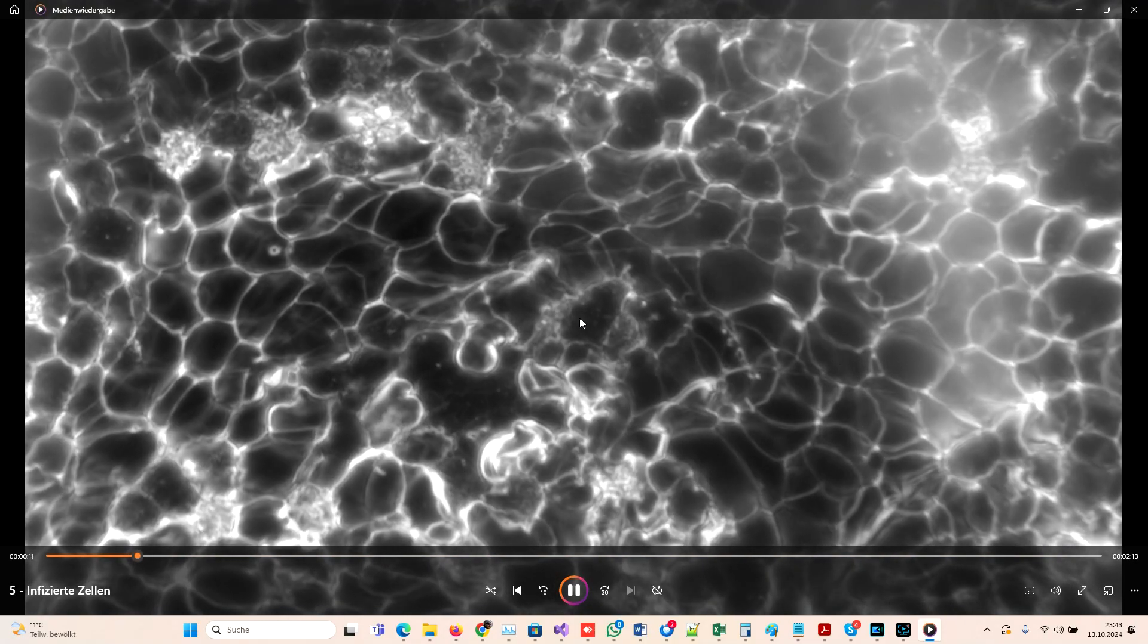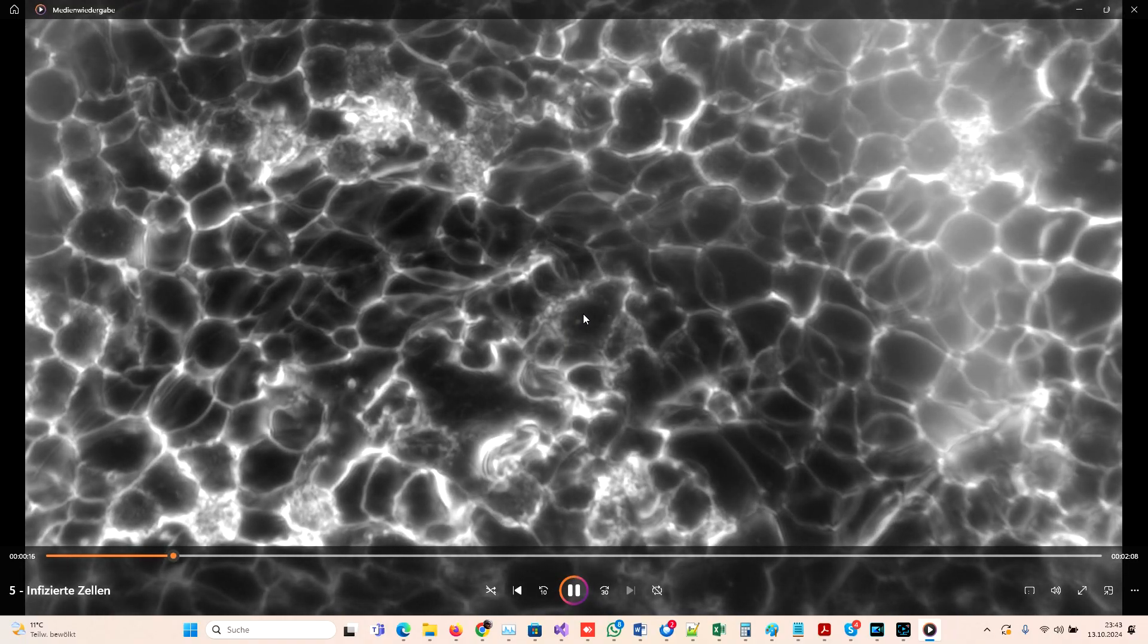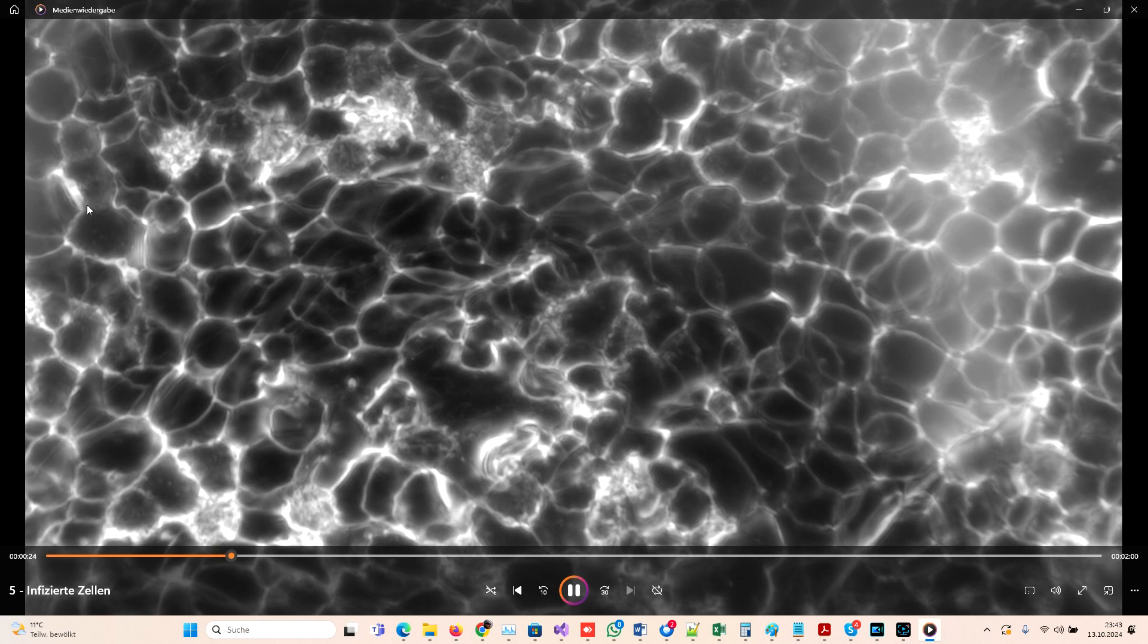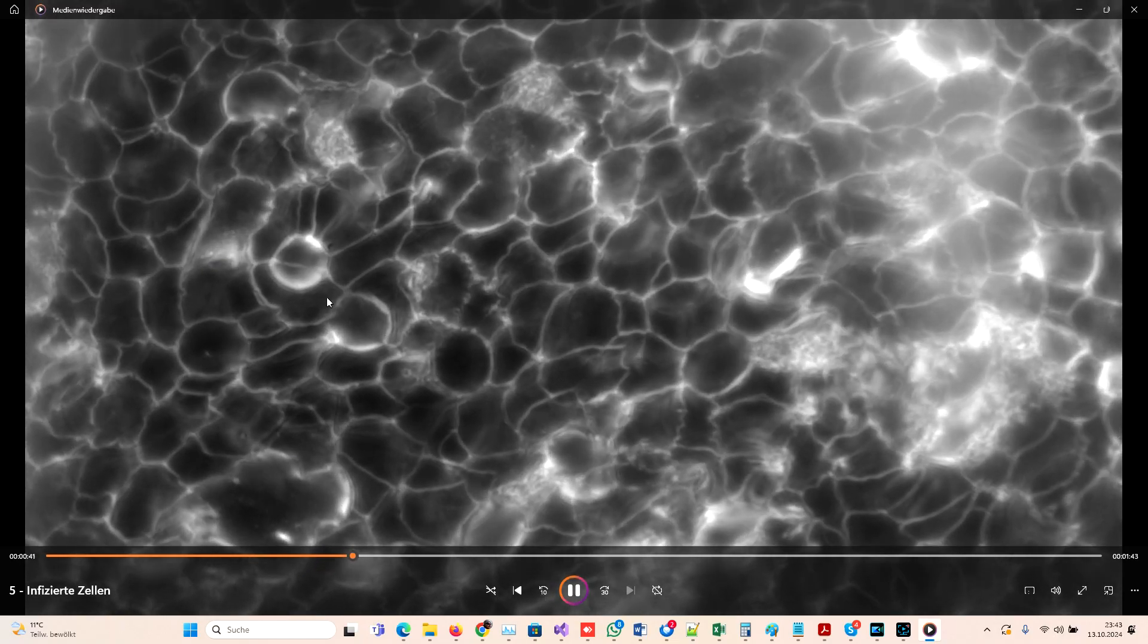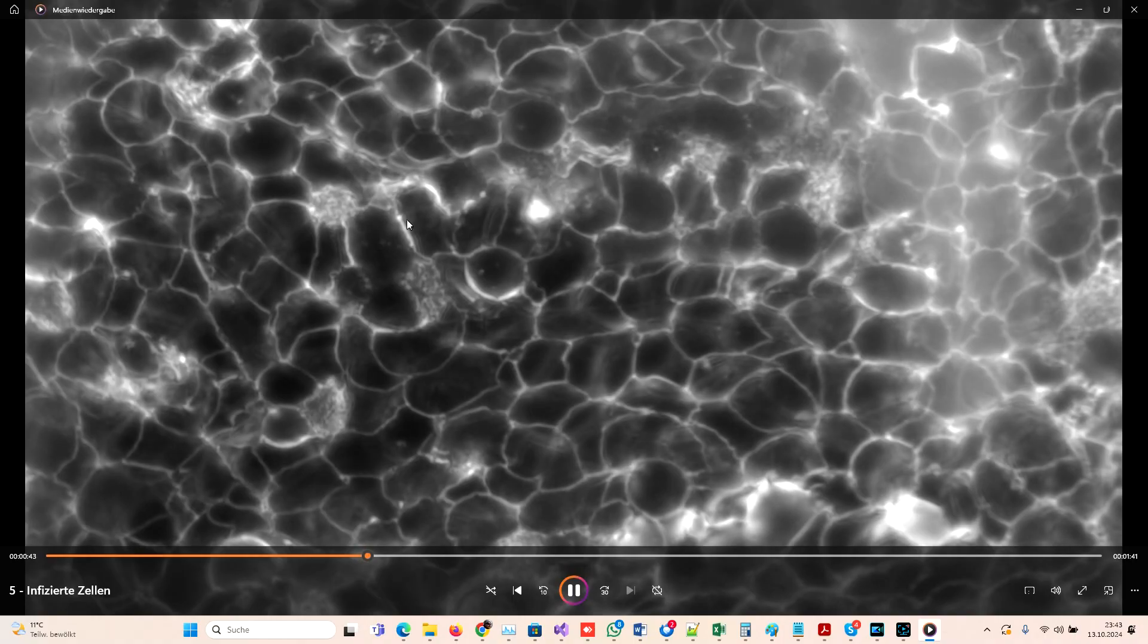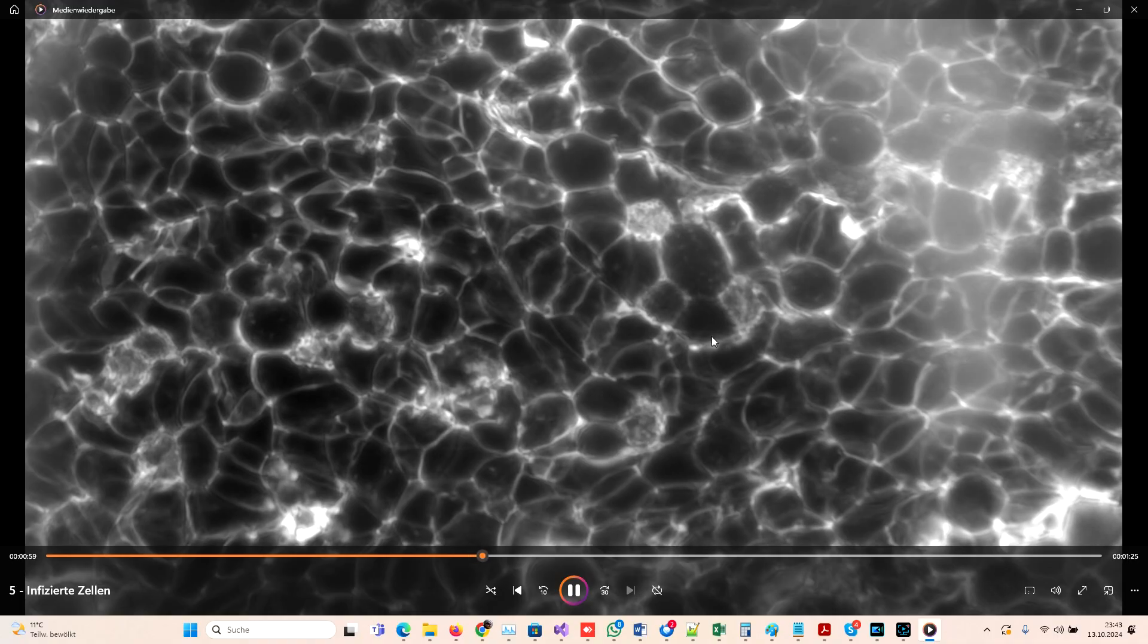In those cells that you see here, you can see some movement, so there is definitely an infectious process going on because actually blood should be sterile. I don't know what kind of species it is that is visible here in those blood cells. I found it interesting to incorporate it in this video to just show you this movement in here. Some blood cells seem not infected, other blood cells seem to be highly infected with whatever kind of organism that is. It's also from a person with Lyme disease, so I would assume that it is Lyme or maybe some co-infection.